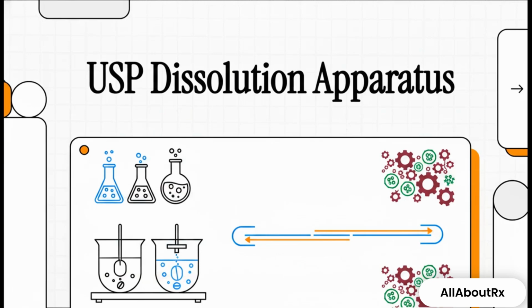Welcome back to AllAboutRx. Today, we're breaking down one of the absolute most fundamental topics you'll ever encounter in physical pharmacy, and that's the USP dissolution apparatus. Whether you're prepping for your board exams or gearing up for those high-stakes pharmaceutical industry interviews, understanding these 7 specific types of apparatus is, honestly, absolutely essential. I'm really thrilled to help you master this material, so grab your notes and let's dive right in.